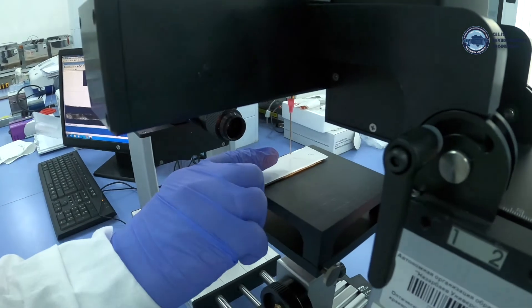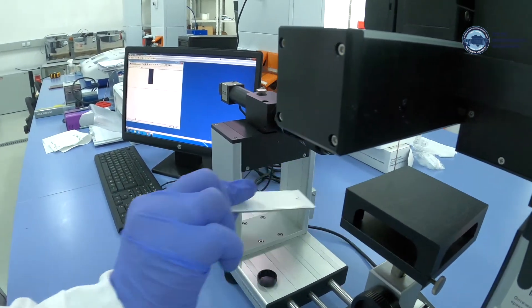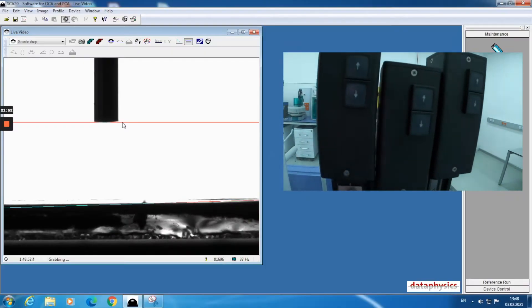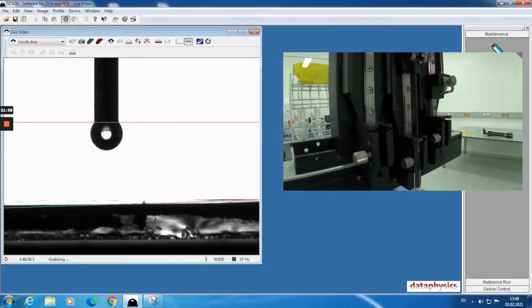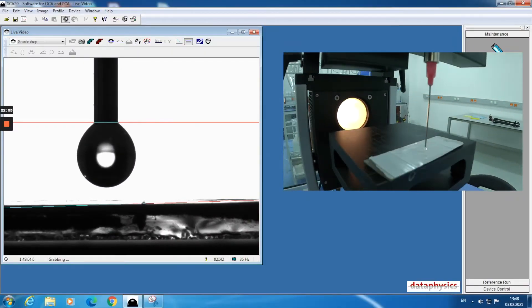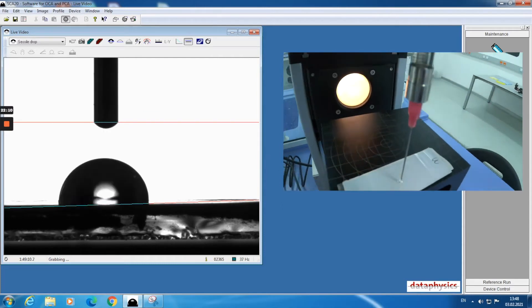Then we will take out our virgin membrane from the device and place the fouled membrane. Now we will perform contact angle measurement of fouled membrane in the same way we did for the virgin membrane.